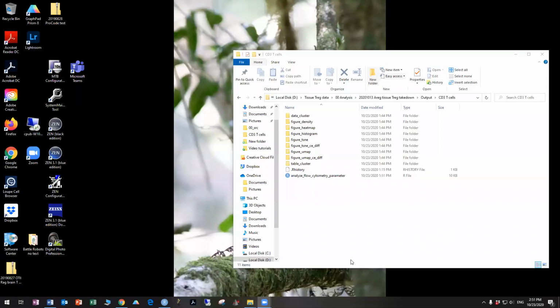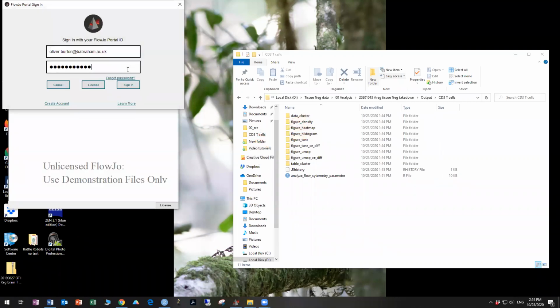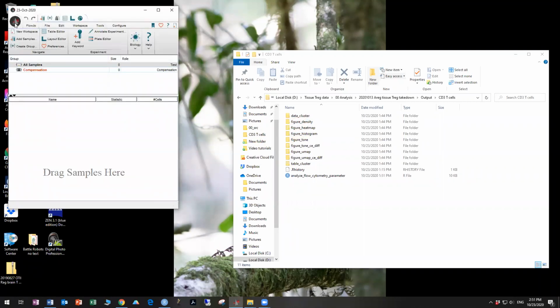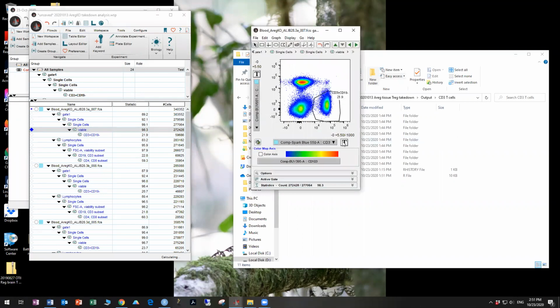Right, welcome back. In this segment, we are going to explore how to set the transforms on your data such that you get better separation with your markers on your tSNE and UMAP plots and in your FlowSOM clusters. If you look at FlowJo for your data set, you will see that the data have a certain pattern to them in that you have division of your CD3 and CD19s, for instance, and we looked at this earlier by changing the transform here on the customized axis.